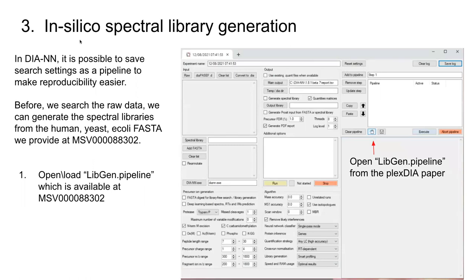The next step is to make a spectral library. Let's say we have a FASTA file and we don't have a spectral library — we're going to want to make one from the FASTA that we downloaded. The first thing to do would be to open the libgen.pipeline file that you downloaded from MassIVE.